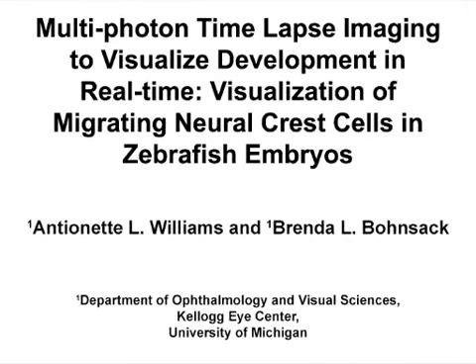The overall goal of multi-photon time-lapse imaging is to capture high-resolution, three-dimensional, real-time images of migratory cell populations. This method can help answer key questions in developmental biology, such as mapping migration pathways of different cell populations.